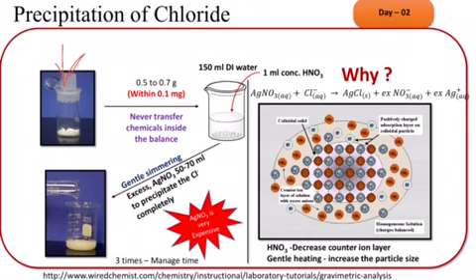Dissolve each portion in a clean separate labeled beaker, using 150 ml of distilled water to which about 1 ml of concentrated nitric acid has been added. Heat the chloride solution on a hot plate and add excess amount of silver nitrate according to the procedure. Stir constantly with a glass stirring rod.